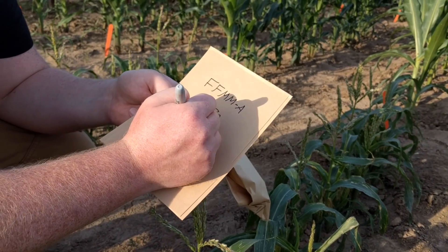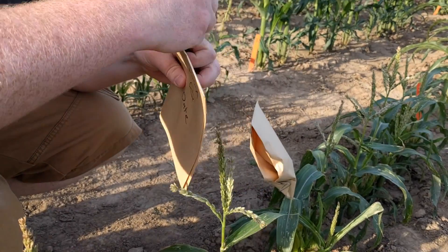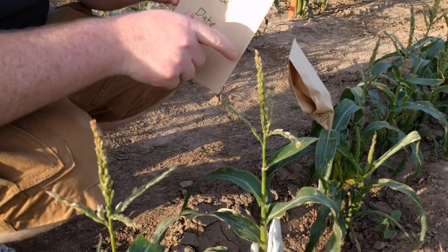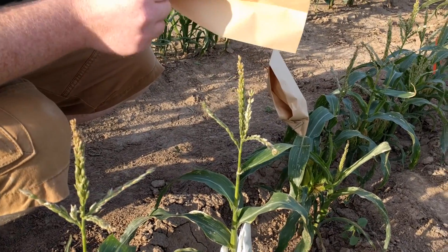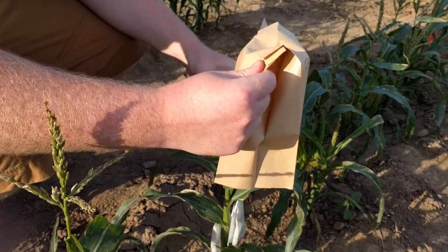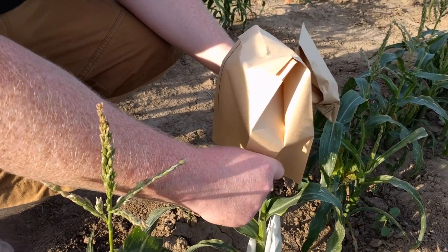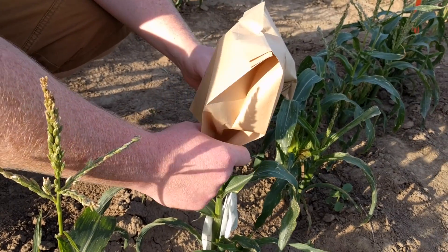As with earshoot bags, full-size tassel bags are too large for mini maize. Cut the bag in half before attaching it to a plant. It is important to give the tassel air space to allow the anthers to extrude. In most standard lines of maize, the tassel is large enough to expand the tassel bag. With mini maize, it is a good idea to invert the crease at the top of the bag to create an air space.